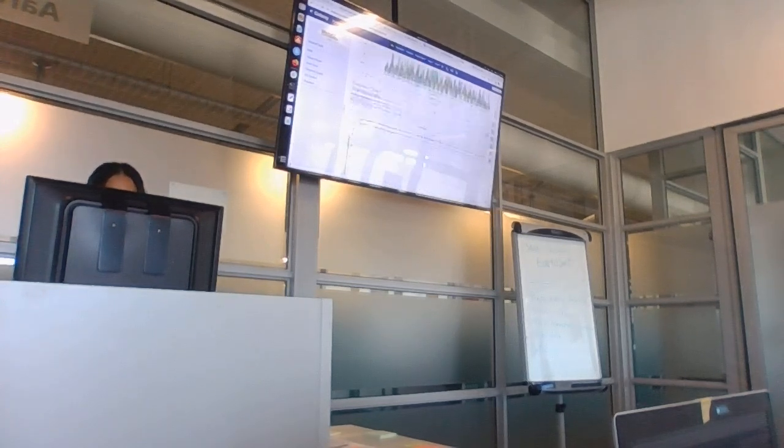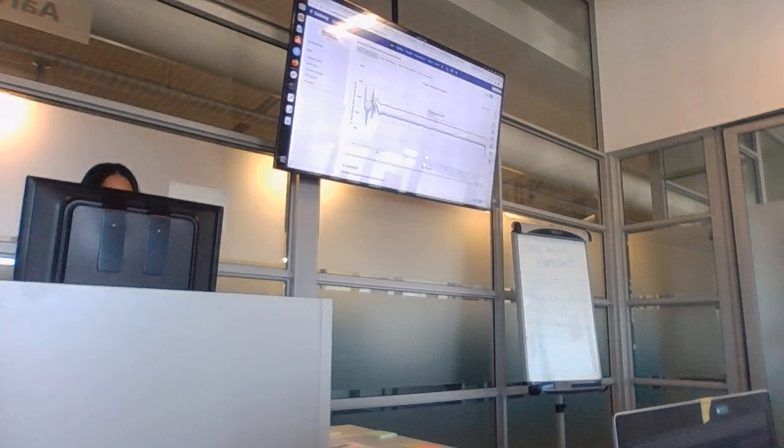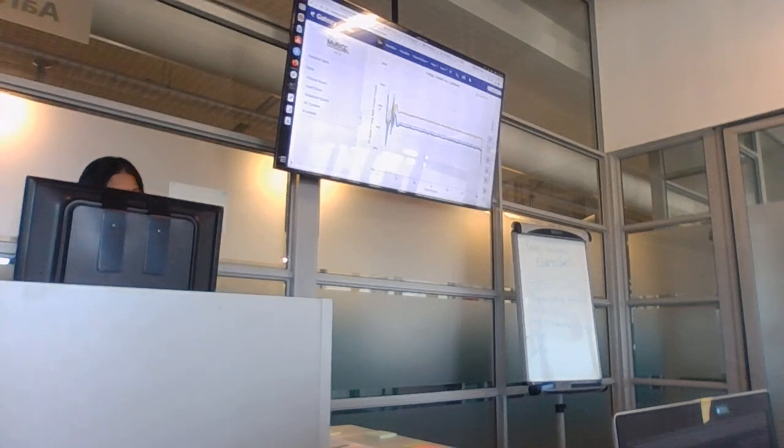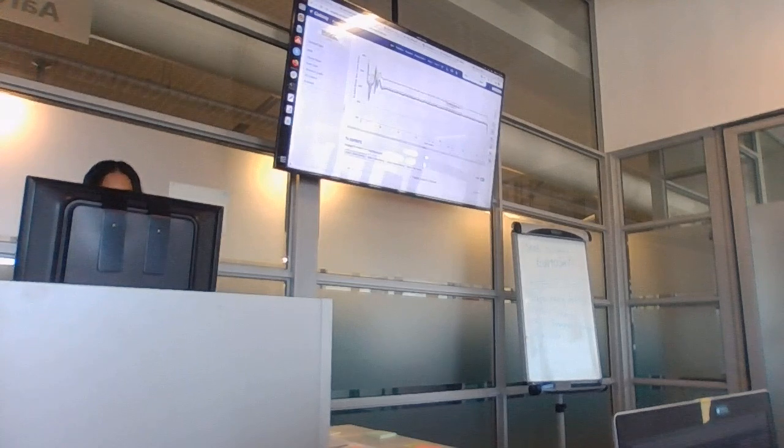Then you may want to go here, because here you can easily see these two are above the rest in terms of GC content. Can you see there's two files that you recognize? They are about 60%. These are the two files, they are around 60%, whereas the others are around 50%. Okay?